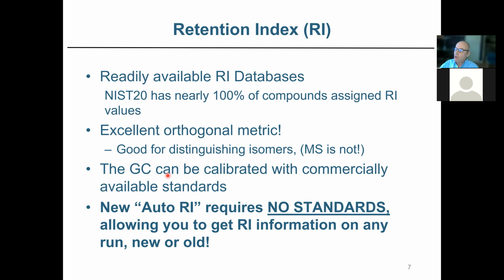It does not require standards, and it allows you to get retention index information on any run. You don't have to have a separate retention index run, and you don't have to have internal standards. You can do it on data that you've acquired today, or you can use it on data that you acquired 10 years ago.